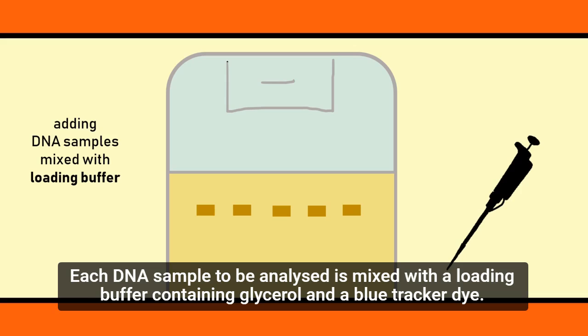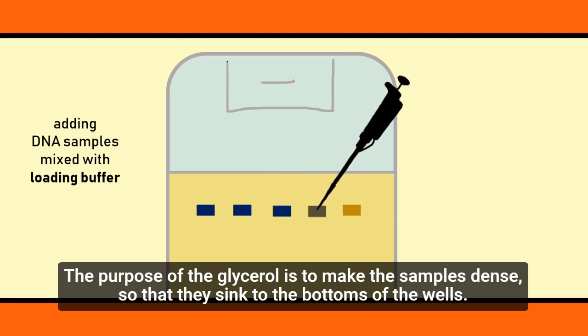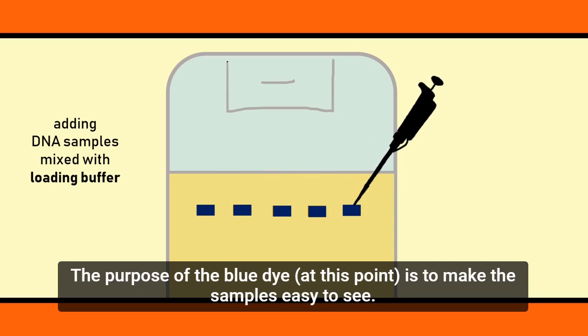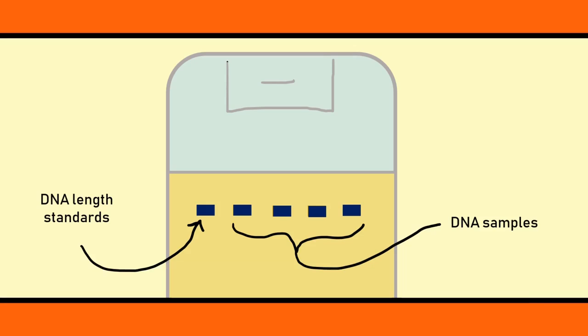Each DNA sample to be analysed is mixed with a loading buffer containing glycerol and a blue tracker dye. The purpose of the glycerol is to make the samples dense so that they sink to the bottoms of the wells. The purpose of the blue dye at this point is to make the samples easy to see. To determine the length of the DNA fragments being analysed, a sample containing DNA fragments of known length is loaded into one of the wells.